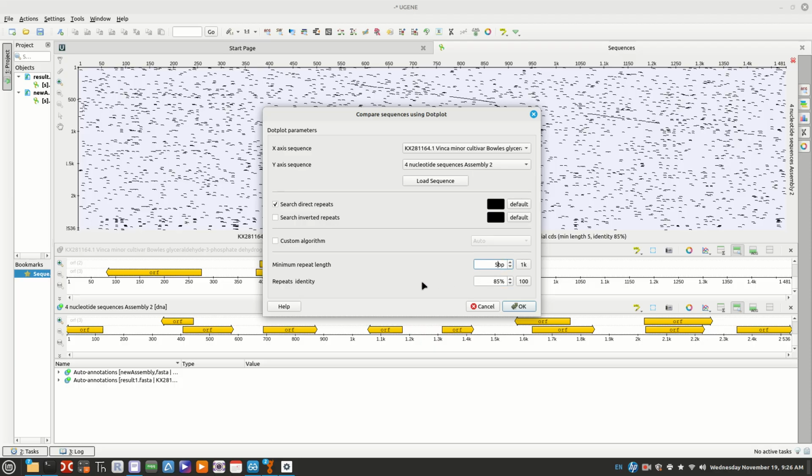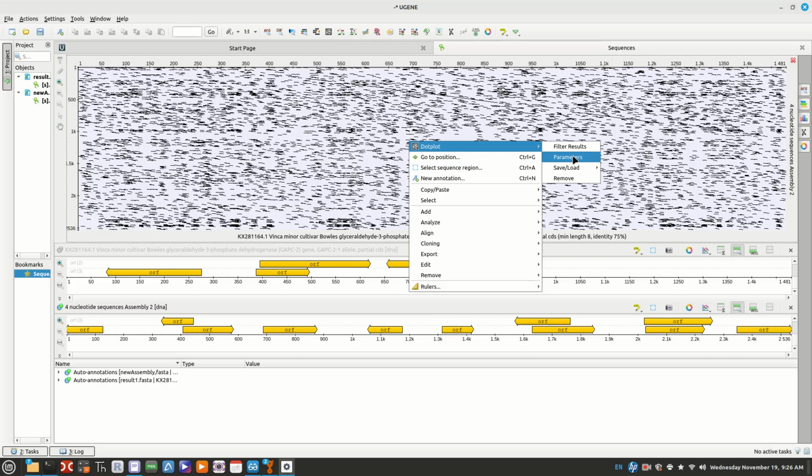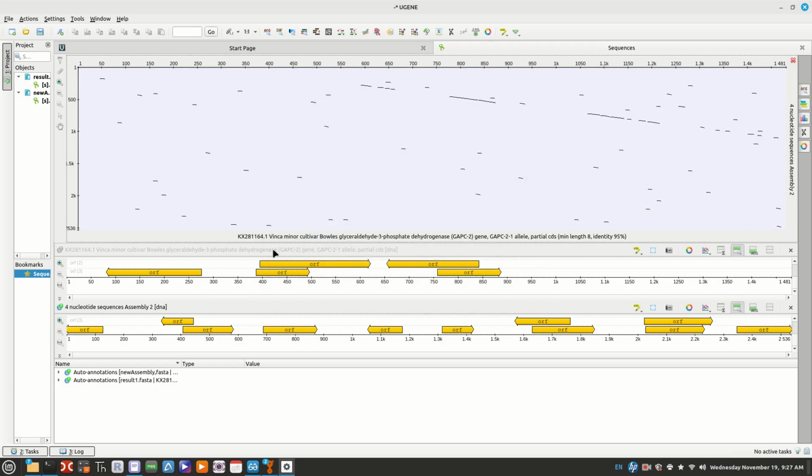No, nope. Let's increase that. Let's go up to about 8. And let's reduce this down to about 75. See what we get. Too messy now. Now you can't even tell. So let's go back up. Let's make it 95. Went the wrong way, I think. There we go. So what we're seeing is the pieces that are aligned really well with, here's our shorter one.